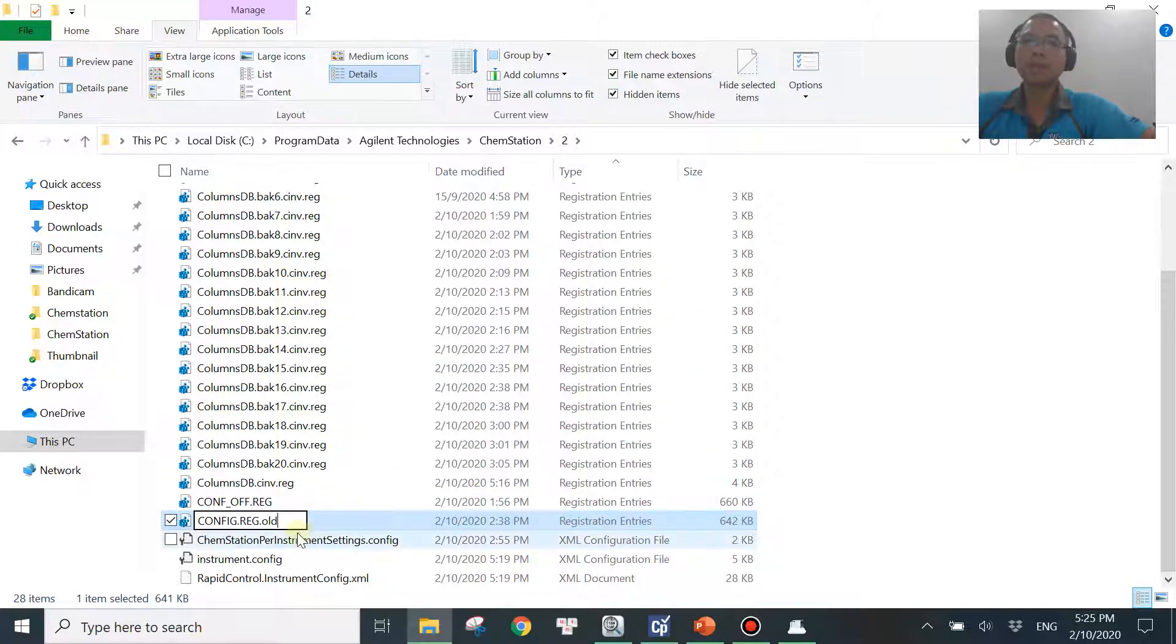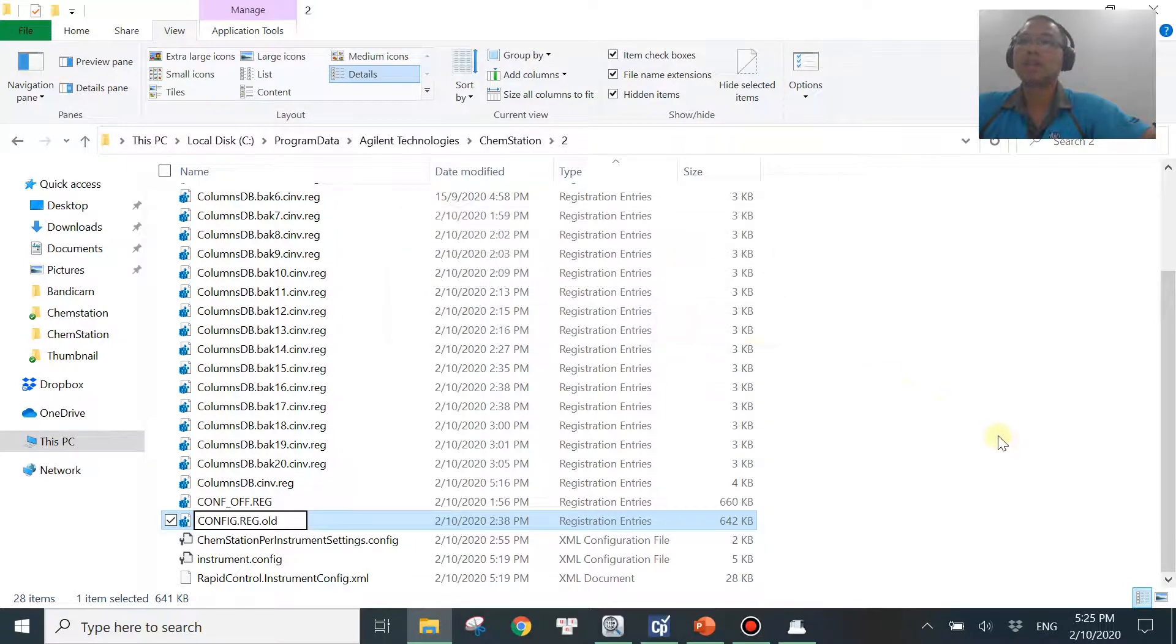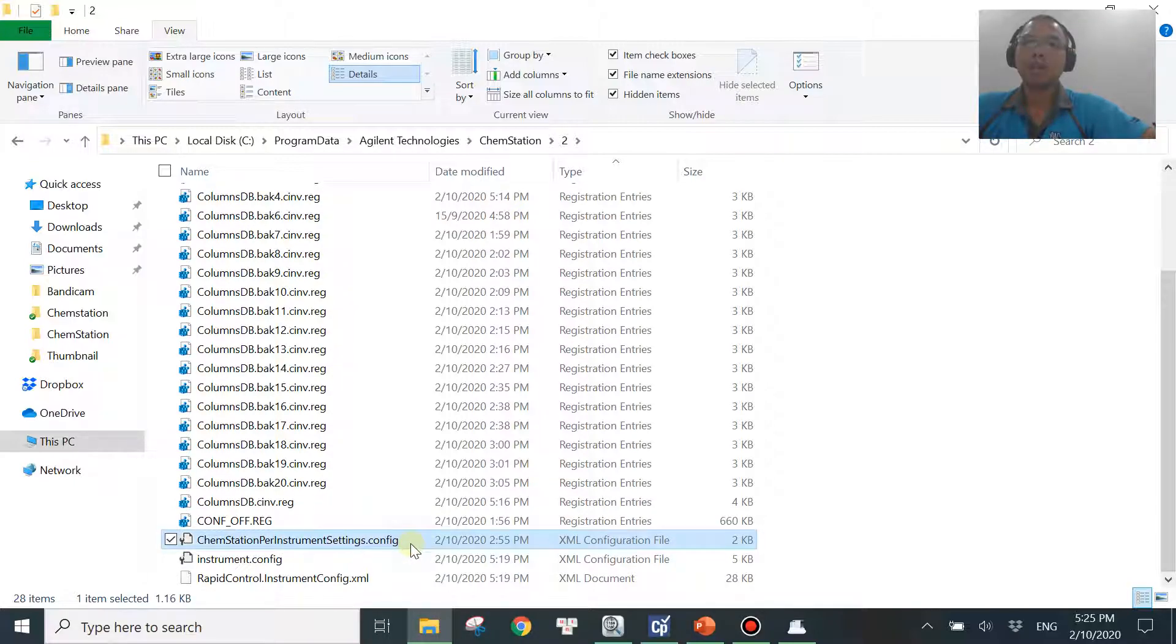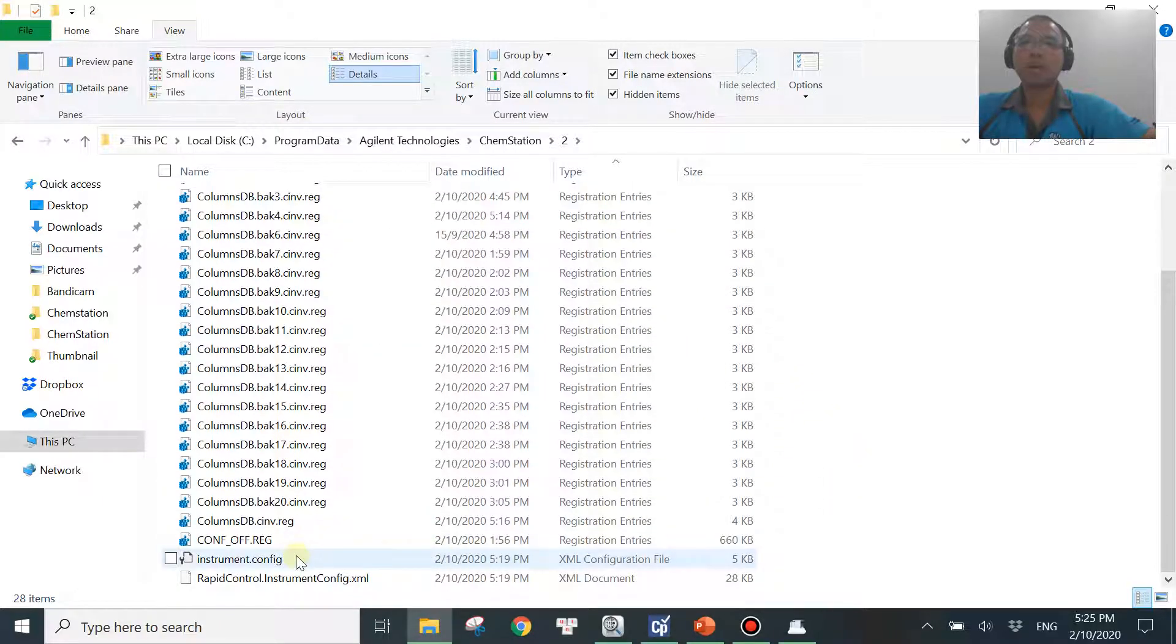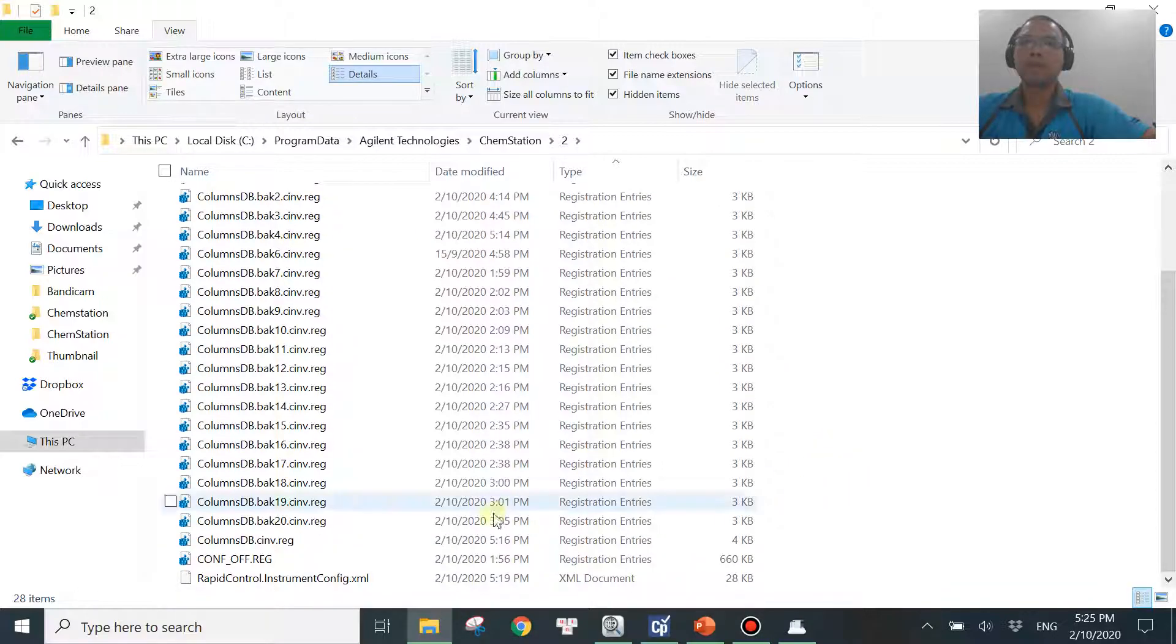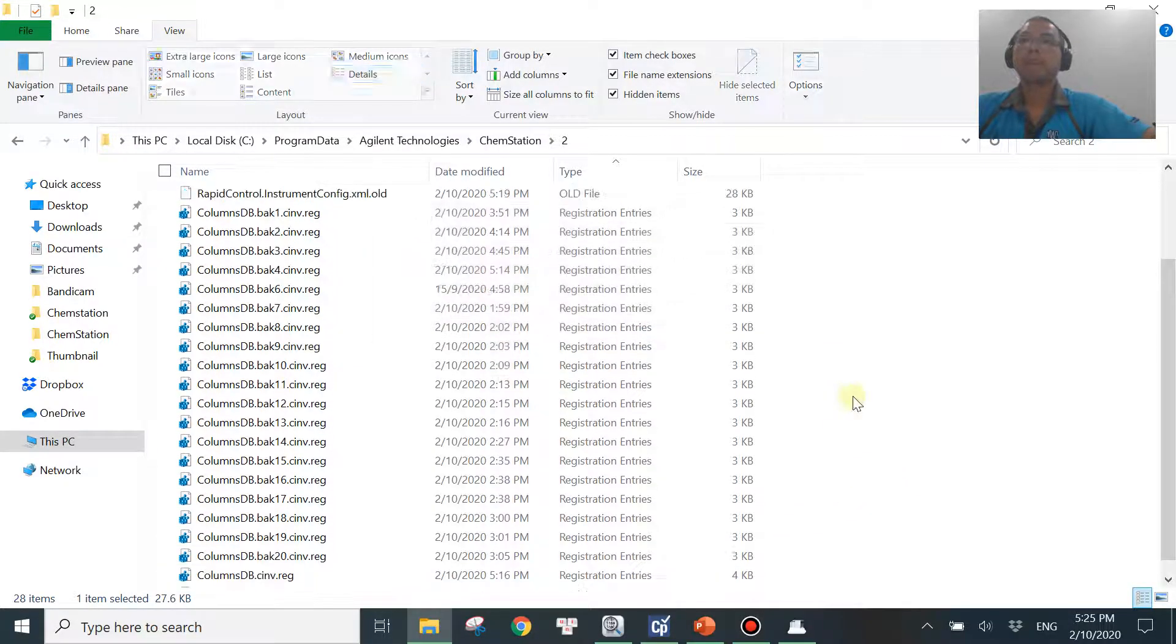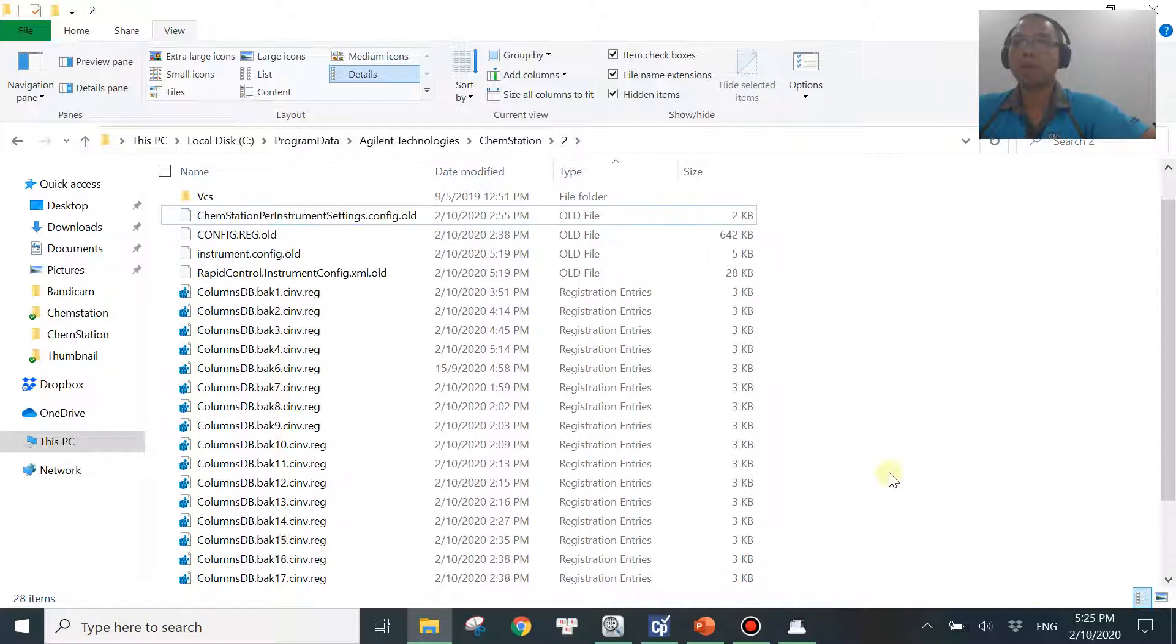So you just add .old at the end over here. Then it will ask you whether you want to accept it. You say yes. And then that's the first file. The second file is you want to change the ChemStation per instrument settings .config. And then same thing. You just want to add .old again. You need to show the extension over here before you add .old. Say okay. Then you have one more. Instrument.config. And when you add .old. And then you want to add one more for the last one. Rapid control.instrument.config .old again. So you have four different .old files over here.